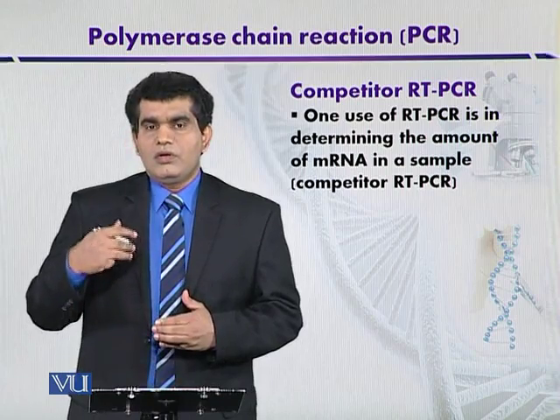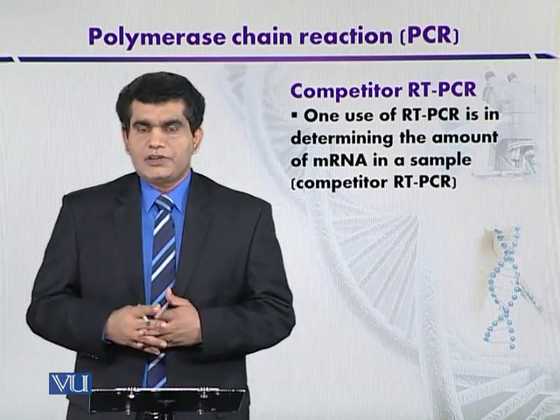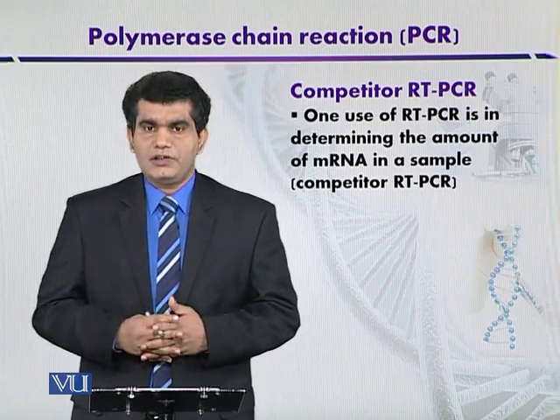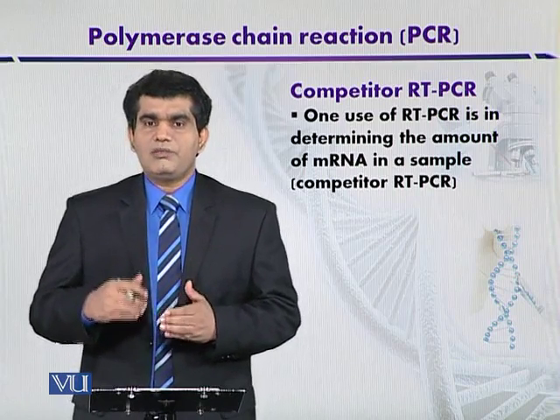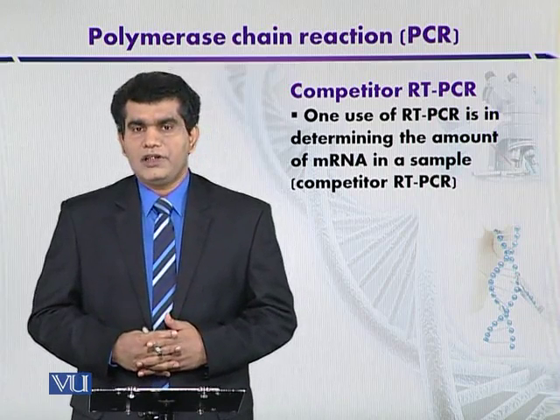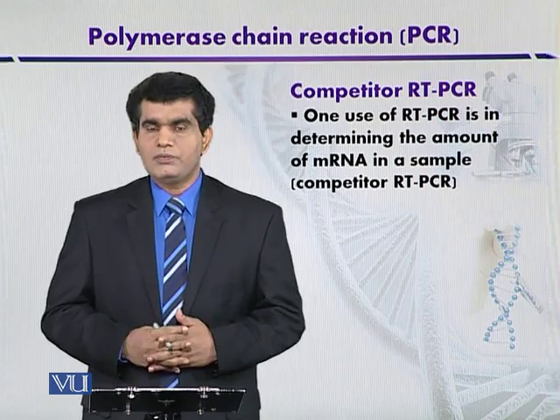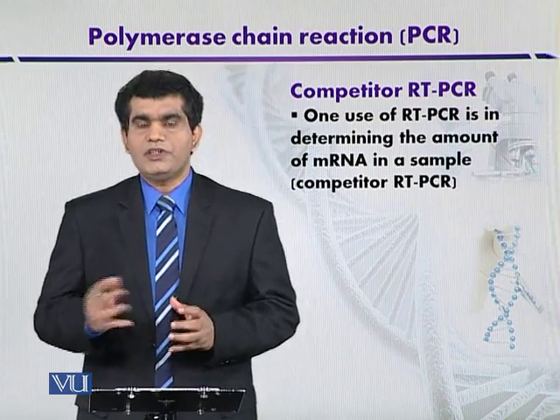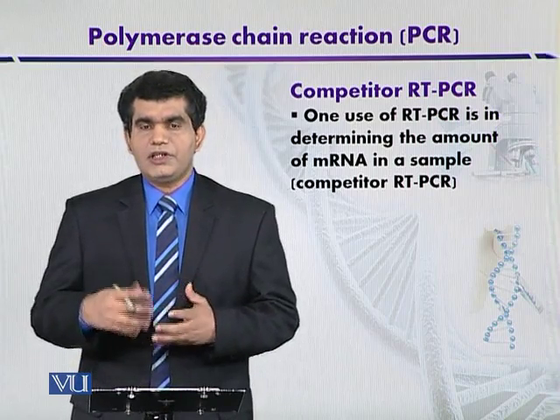So when the genes they are expressed, they are transcribed into messenger RNA, and this technique it can be used to quantify low amount of RNA that are produced in the tissue, as well as under in vitro conditions. This competitor RNA technique it can be used.